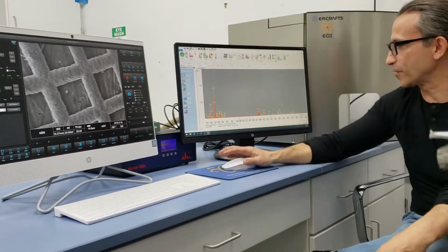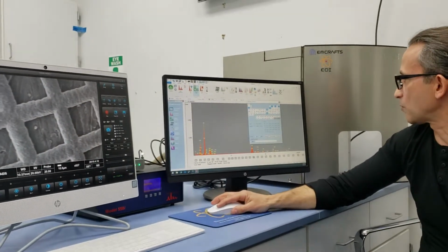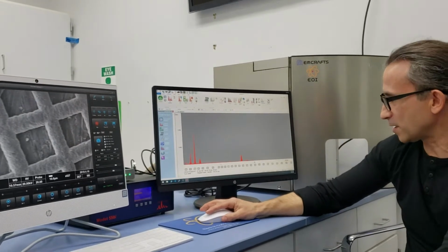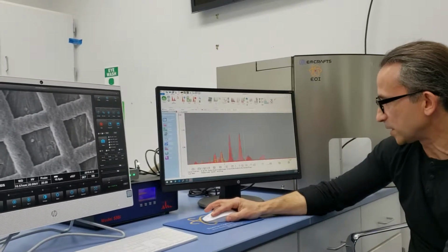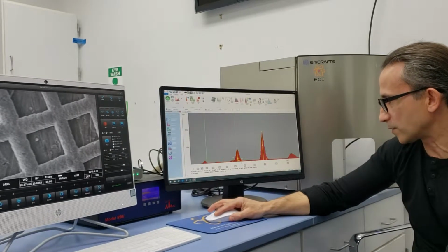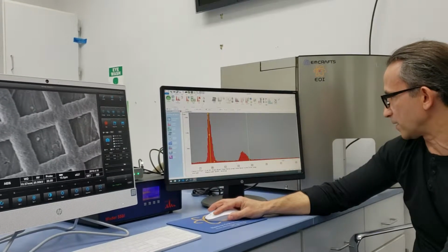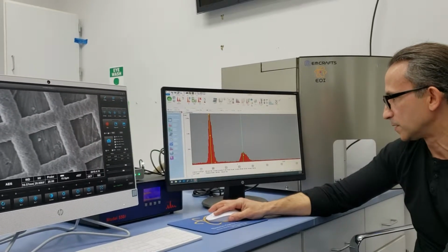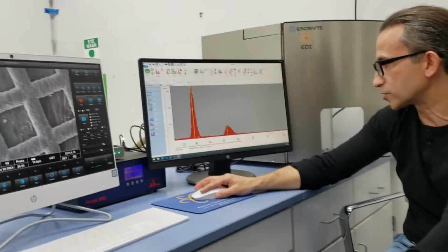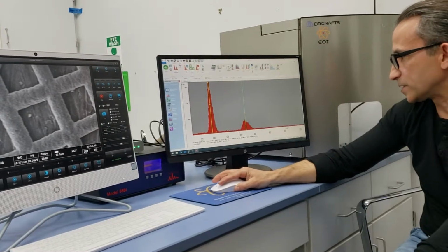So it helps the new operators because when you get a spectral window, right? So when the spectral window starts acquiring, like it did, right? Let me clear the list. For an operator, it's very easy to say, oh, you know what? Does that line up? Oh, yeah, it does. Let me open up. Oh, yeah, look at that. Aluminum's there too. Great. And then, well, you know what? Carbon. Yeah, that's good. Okay, and oxygen. Okay, I can see that. But what's this guy? All right, he's not lining up. So then I got to go by the cursor. Or, you know, he might be difficult to label via the cursor as well. Because I'm not seeing AU pop up.